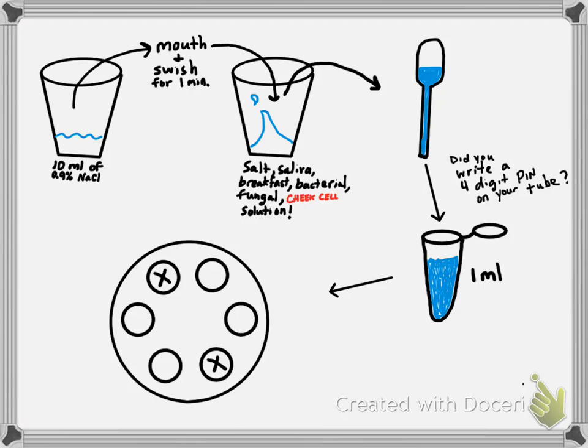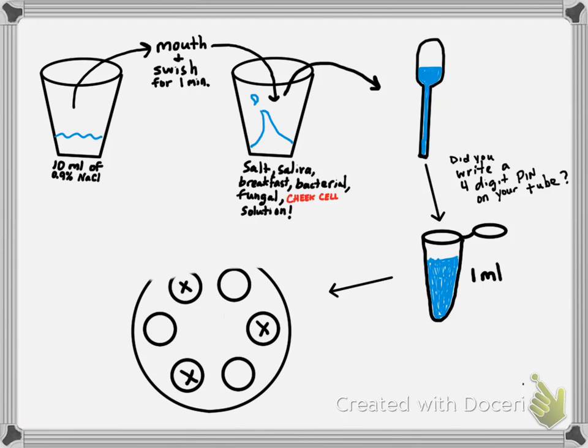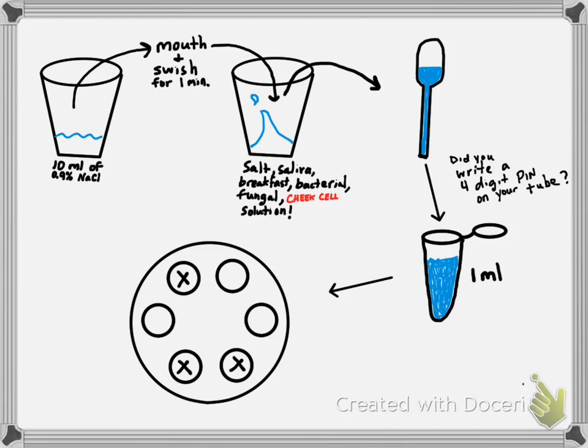Okay, so we can go like this, or we can go like this, or we can go like this. Okay, you can't have lopsided rotors by putting all the tubes next to each other if you have 2, 3, or 4 tubes. They can't all be next to each other. You can't have 1 tube, you can't have 5 tubes.